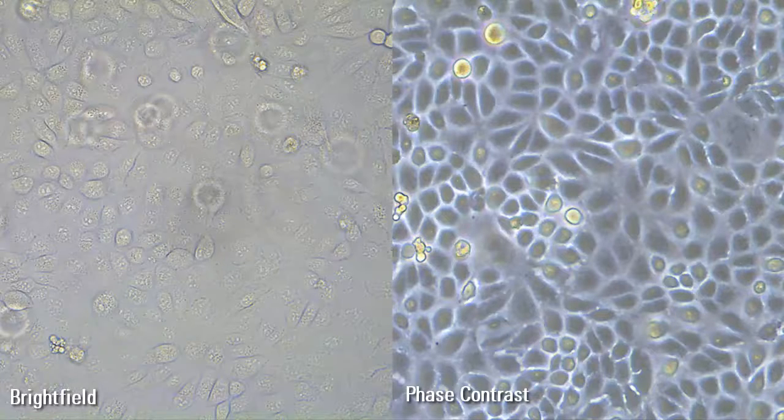On the Leica DMI1 this can be done by simply moving the slider housing the condenser annulus. The phase contrast image gives a better overview and makes inspection of the cell morphology and cell counting easier.